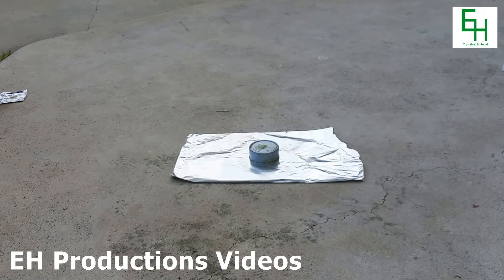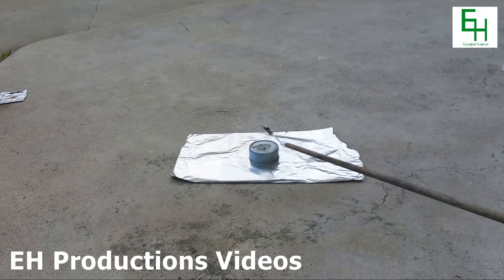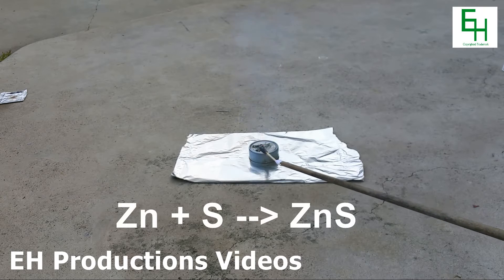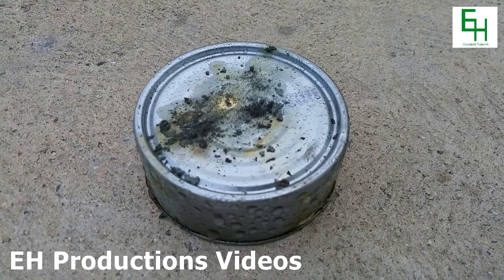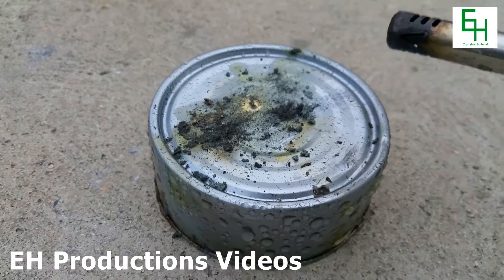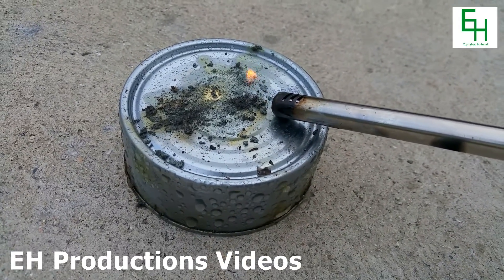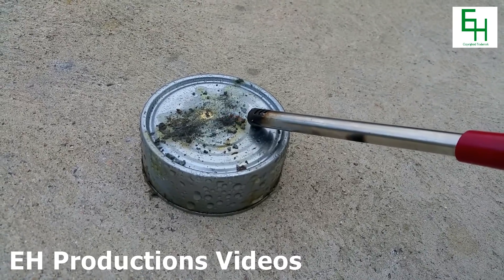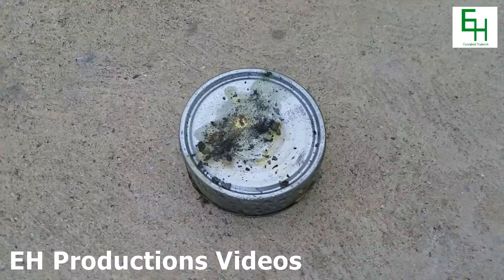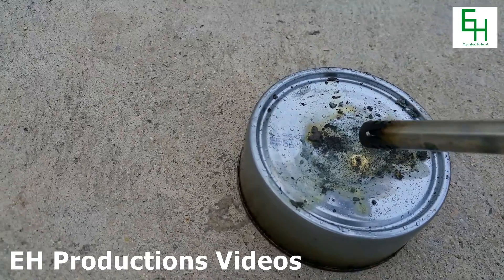Now I'm going to put my welding gloves on. We got some sort of reaction there. Here's what we have — as you can see, there's some unreacted bits of the mixture, so I'm going to try to light it up. It looks like nothing's really happening, so later I'm going to test to see if it actually glows in the dark. I think that little yellow spot over there is the zinc sulfide that we made.